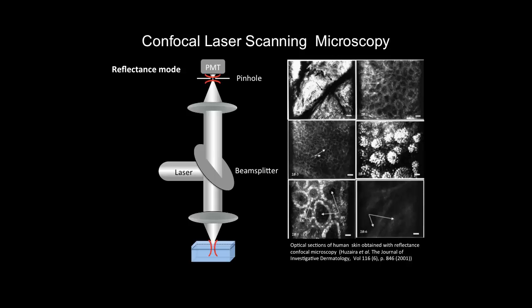So when you close this pinhole, you select the amount of signal that you collect. If you follow the intensity beam distribution I tried to show, by closing the pinhole you collect the signal close to the focal point. When you open it, you pretty much collect what was generated in the entire focal volume.